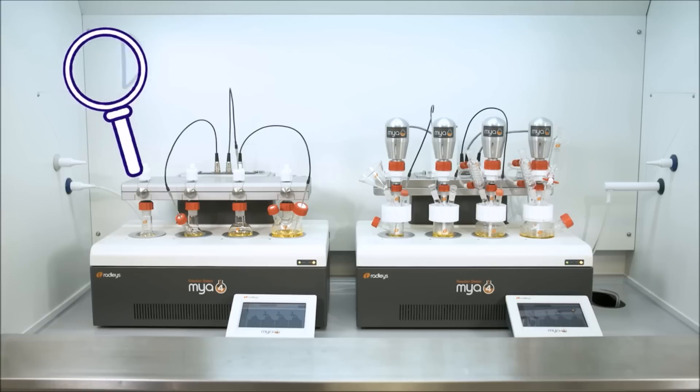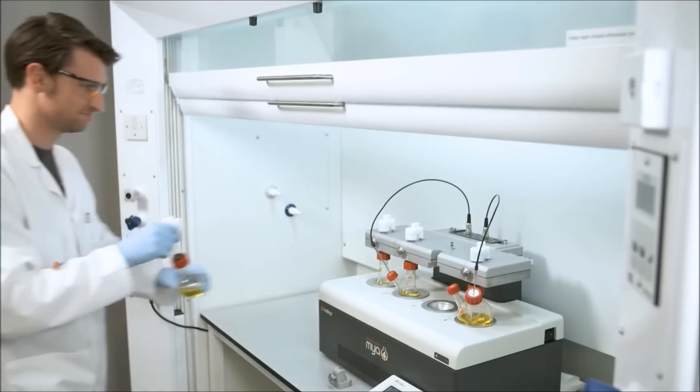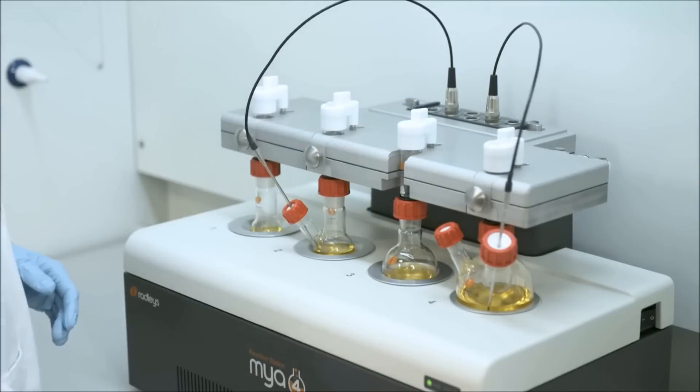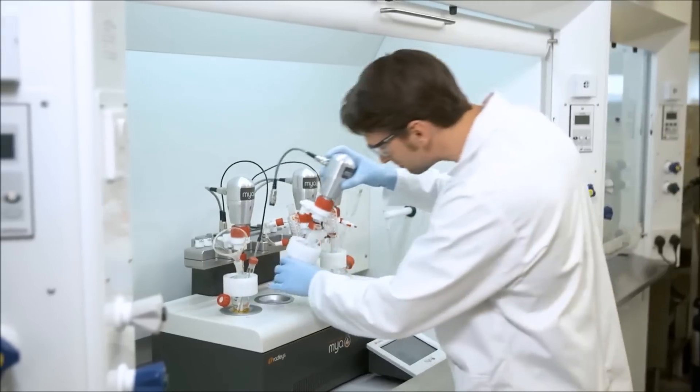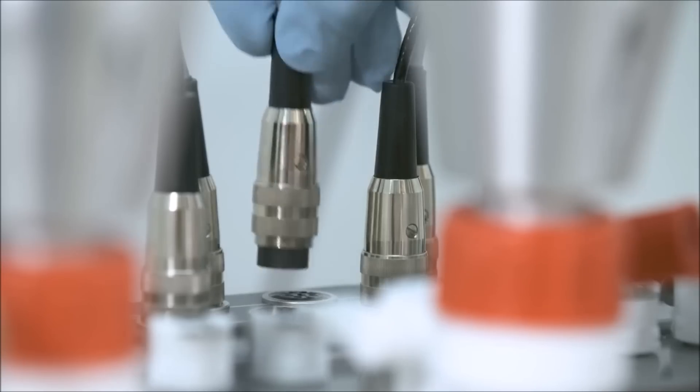Set up Maia 4 in any configuration you like or choose one of our pre-configured packages. The Discovery package with magnetic stirring is ideal for test tubes and round-bottom flasks. And the process package with overhead stirring and process vessels is perfect for mimicking jacketed reactors.